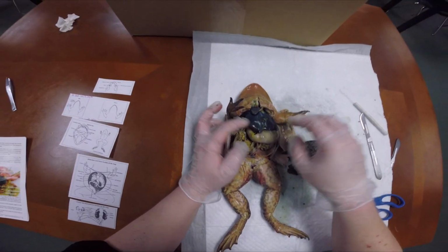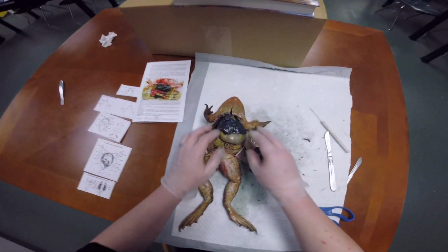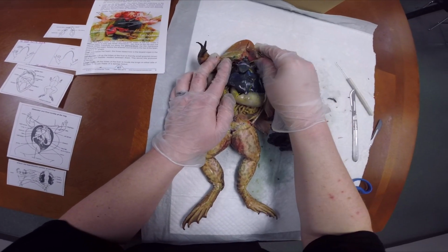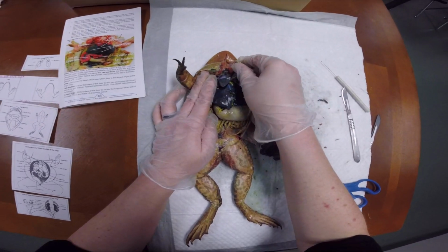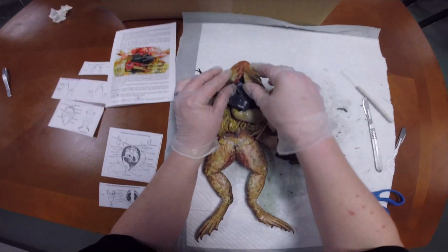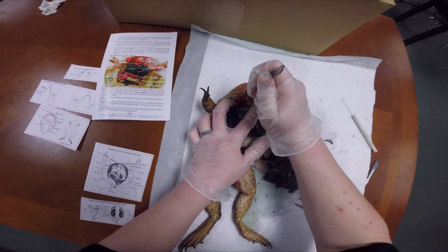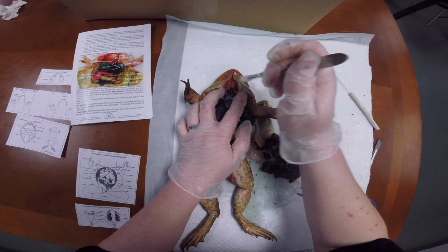Okay, perfect. So now we're going to identify the insides of Mrs. Bullfrog here. So at the top here, you can kind of see the esophagus in the mouth.